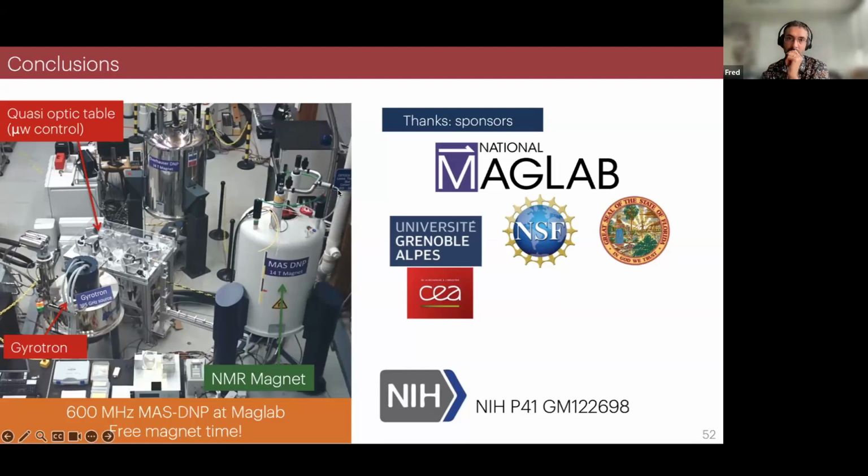No, actually, if you deuterate your molecule, you can actually hyperpolarize outside. Among details I'm not mentioning is that, for instance, nitroxides tend to form hydrogen bonding with the surrounding water molecules or the glycerol, and therefore you can have a dense proton network around the radical, and it's just the dipolar hyperfine coupling which is going to mediate here the hyperpolarization. So when you deuterate, you in principle remove all the protons that are relaxing quickly by removing them from the molecule. And you're not preventing polarization to escape.